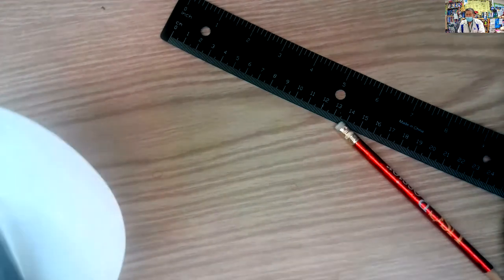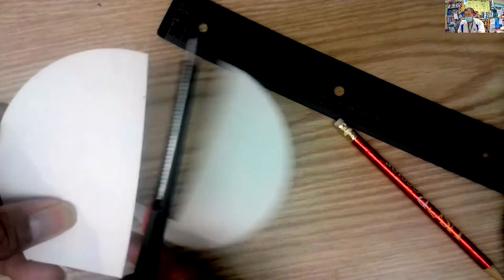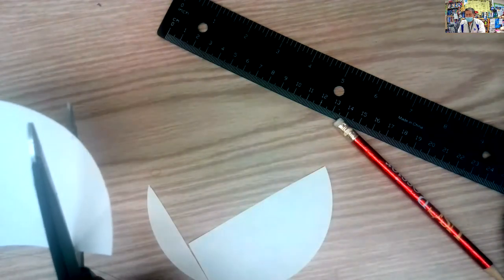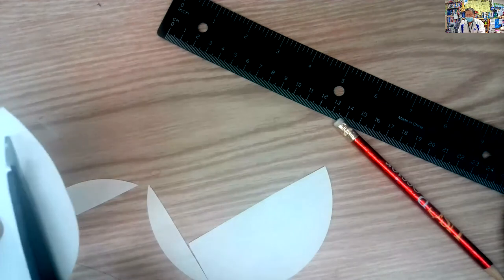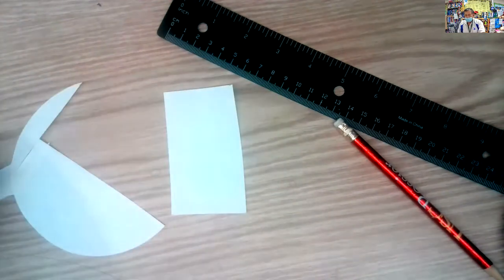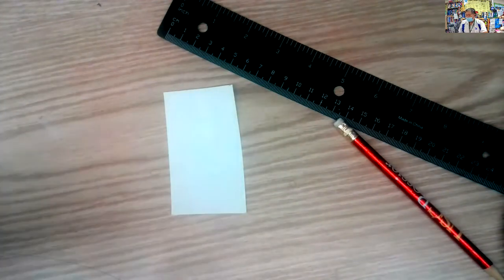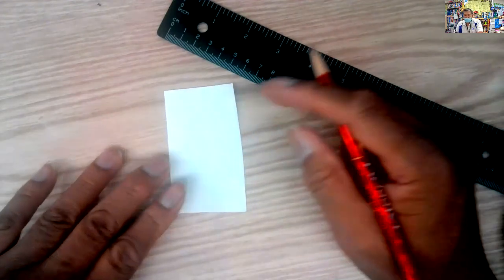Okay, so cutting the strip. By the time you're done, you're going to have something that looks like this. Whether yours is laboratory grade filter paper like I have, or a paper towel, or a coffee filter. Actually, a coffee filter worked just fine. I have some in the other room, but I happen to have this available.